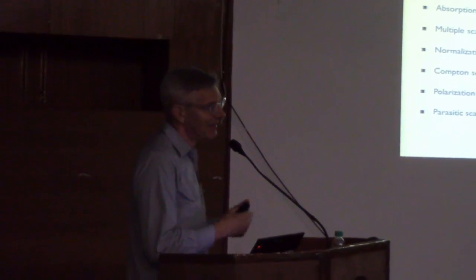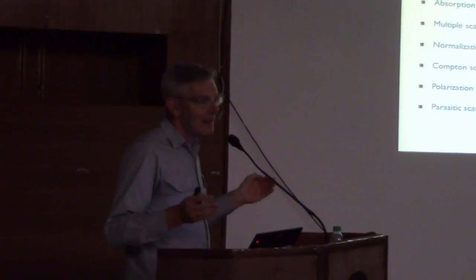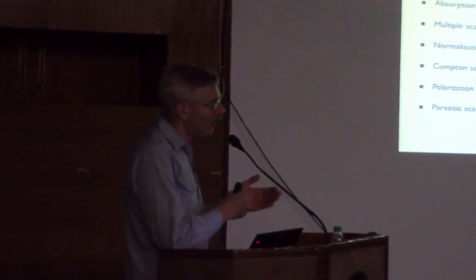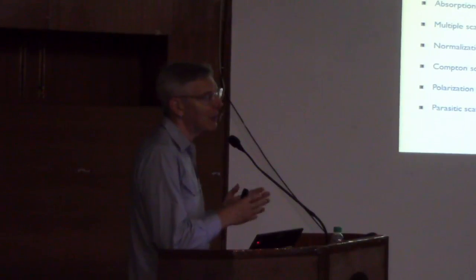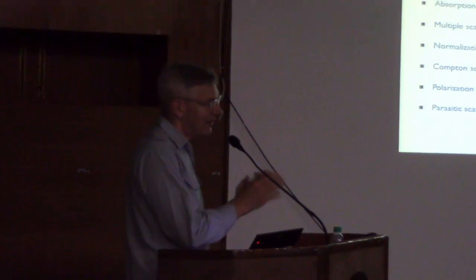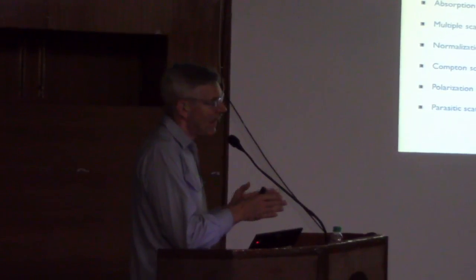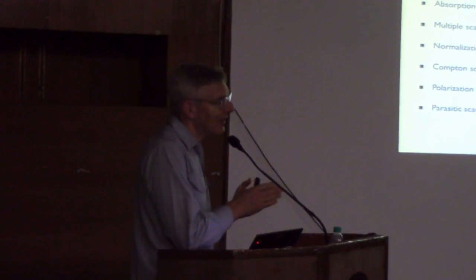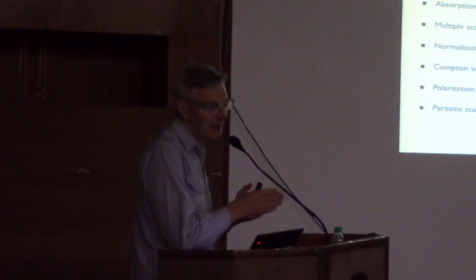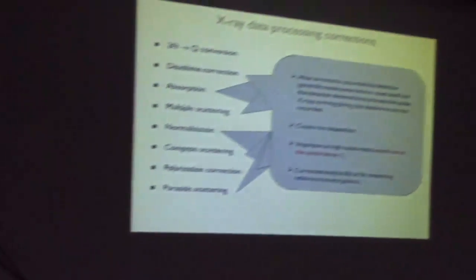But then if you don't put much intensity on your detector, you slow down your whole measurement. So we make a compromise. We allow some dead time to occur, but we predict what that dead time will be because we know how much time it takes the detector to recover. So we know the detector dead time, and we predict the number of photons that probably arrive during the dead time. That's a theoretical correction that we do.